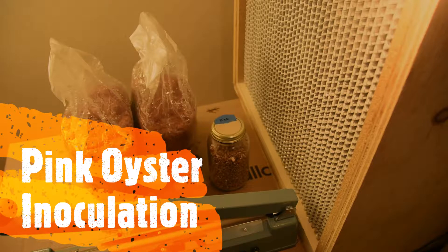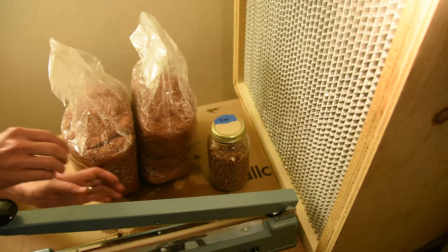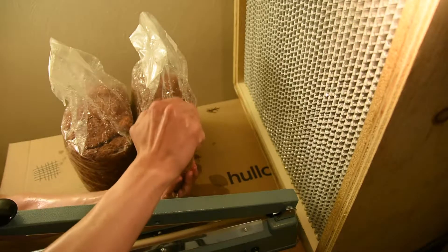I'm going to show you how to inoculate sawdust bags. We're going to use pink oysters. I've already prepared the workspace, gotten rid of everything I don't need, sprayed down the whole area with rubbing alcohol and let it dry. I've just sprayed my hands all the way up to the elbows with alcohol.